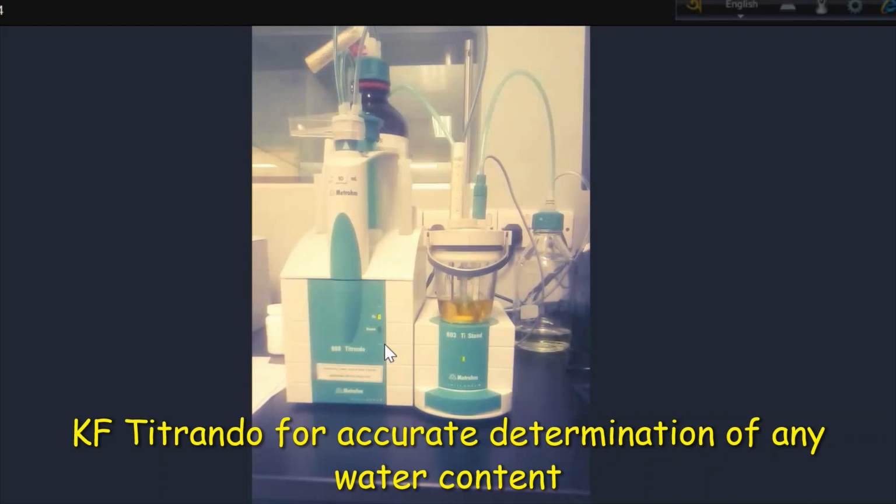The Karl Fischer method is highly sensitive and specific for water determination, and it is widely used in various industries where accurate measurement of water content is critical for quality control and product specification.